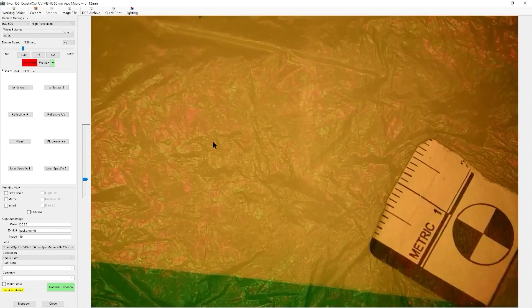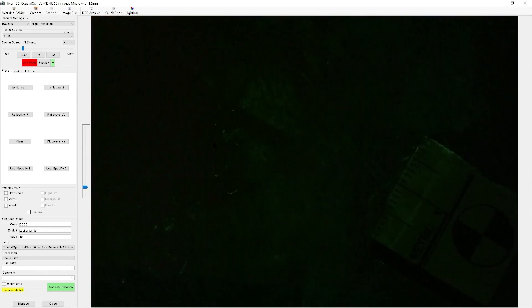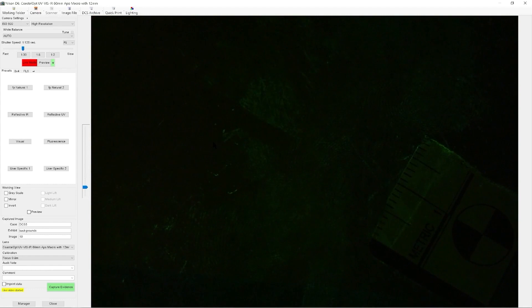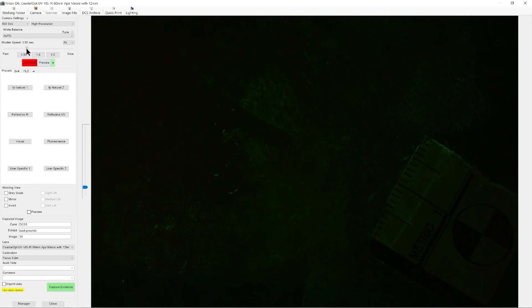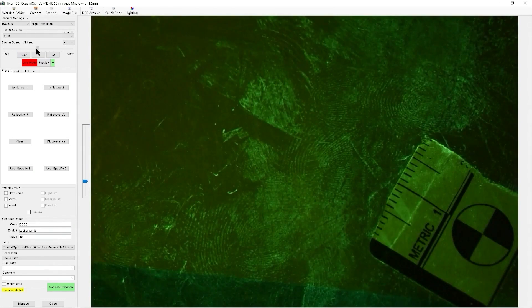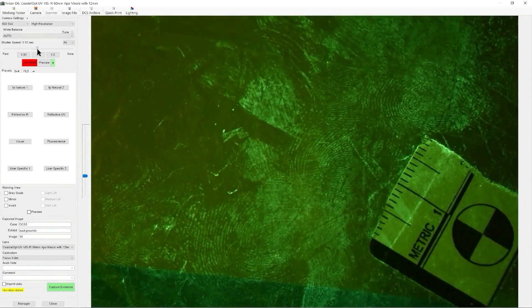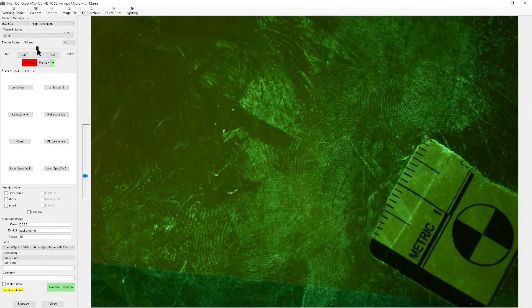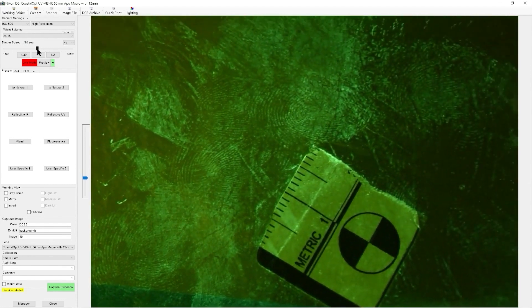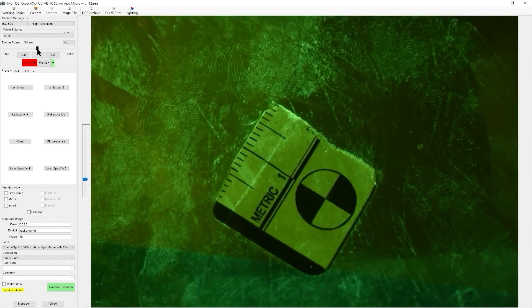So we're now going to add our filter and change the colour of the light into the blue with the 476 filter on the light source. If we now adjust our brightness a little bit, you can see how easily we start to see extremely weak fluorescence.